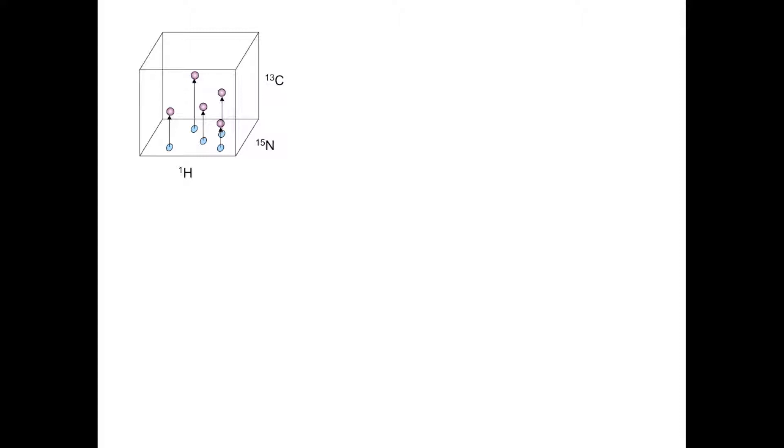What you end up with is essentially lots of blobs or 3D peaks floating in a 3D cube. That's not a very useful way of looking at a 3D spectrum, so instead we look at individual planes out of that cube.